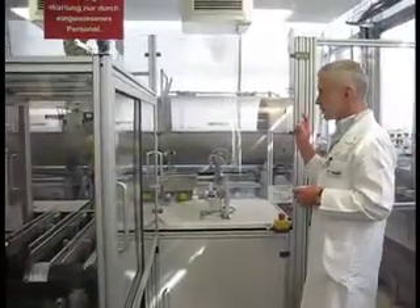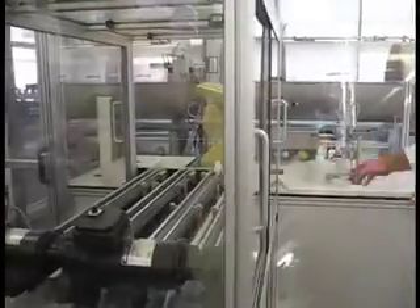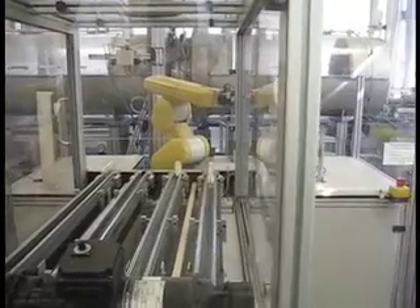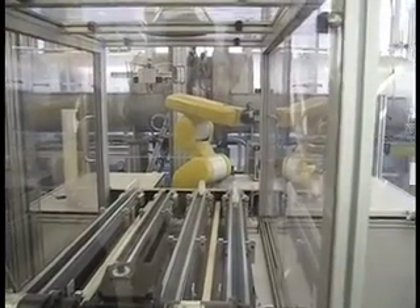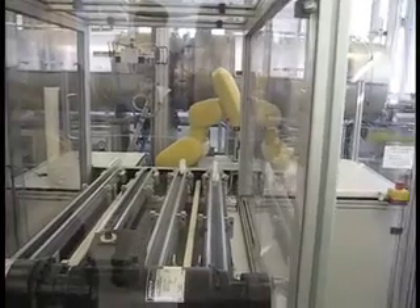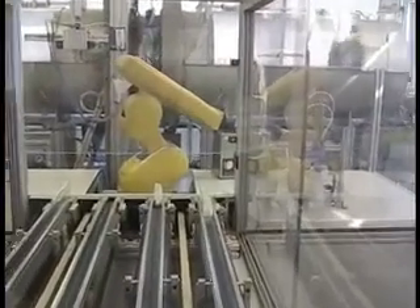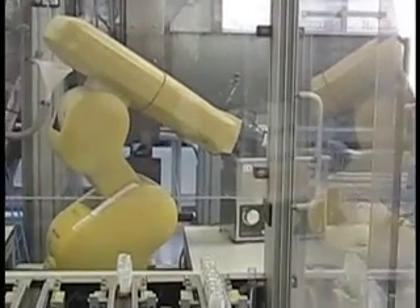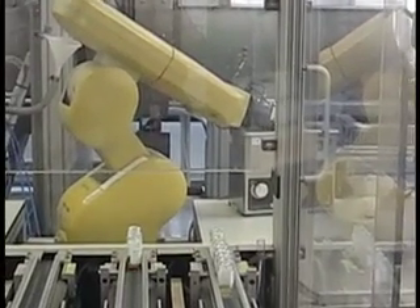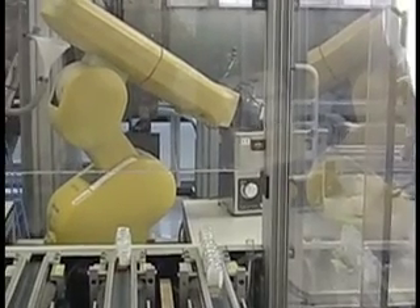The compounds which are being used are here, prepared. They're in the DMSO, the stock solution, and they are diluted to the required concentration immediately before they are applied to the plants, which is what that robot arm is now doing. Of course, something to make sure that if it's not a solution, it's at least a good fine suspension.